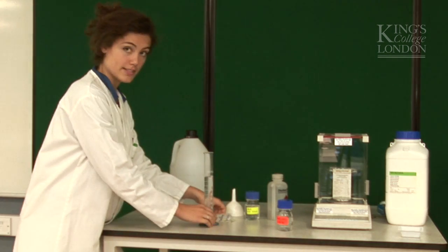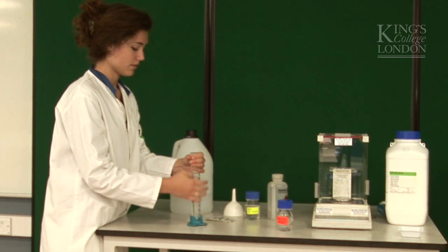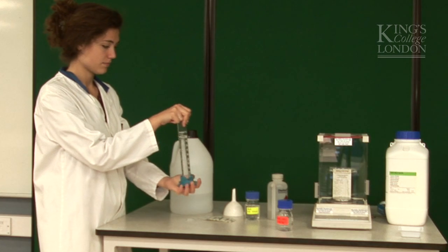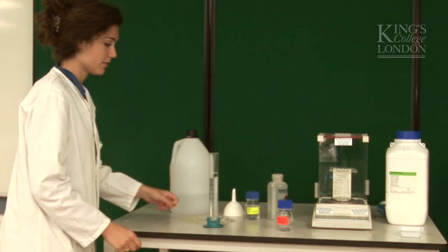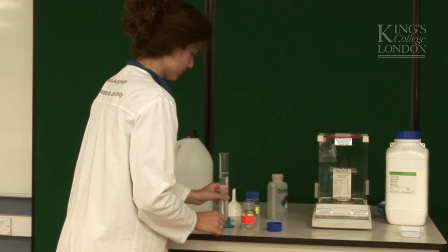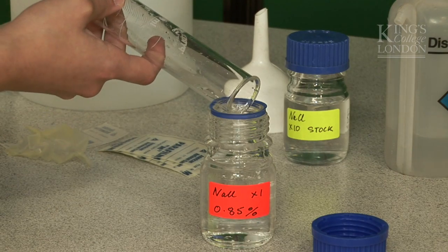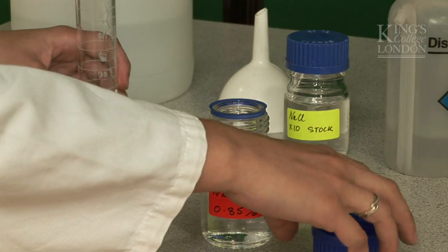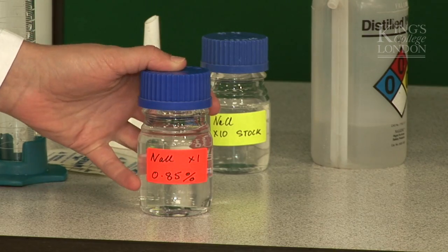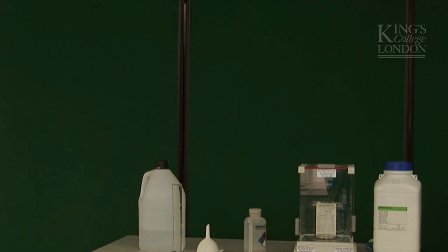And as before, let's mix it and put some parafilm on top. Then pour it into our final bottle. So here we have our working solution and the stock solution. Good — so I can now do my experiments.